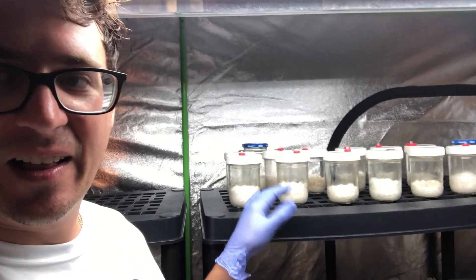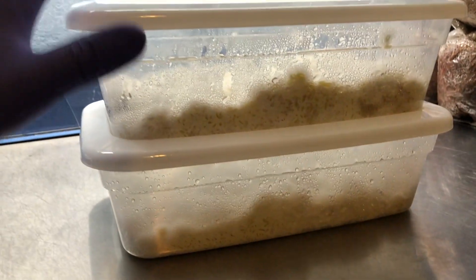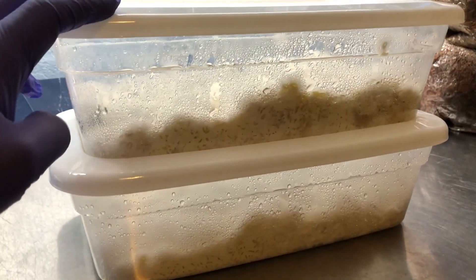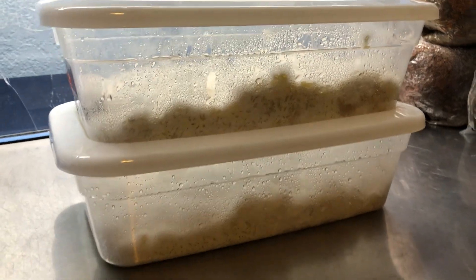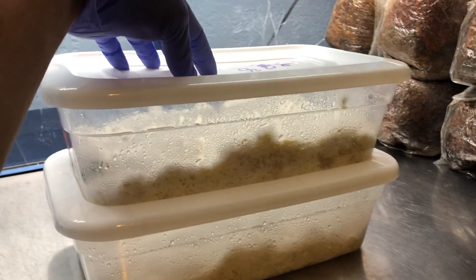Back in the lab — you can see here, there's a sign of some trichoderma forming again. I just caught it pretty early. You can see it right there on the surface of the substrate. This is the second time that this has happened to the tubs.